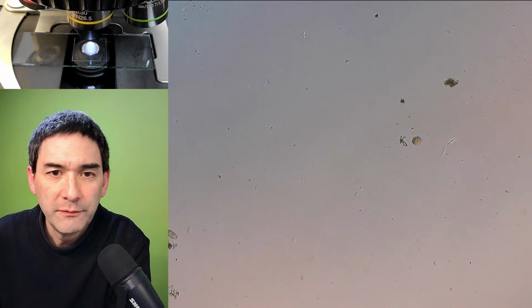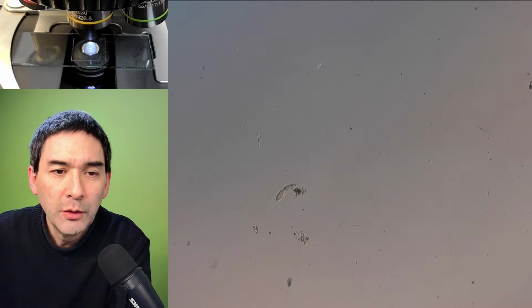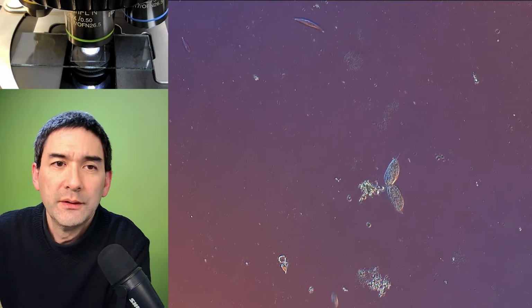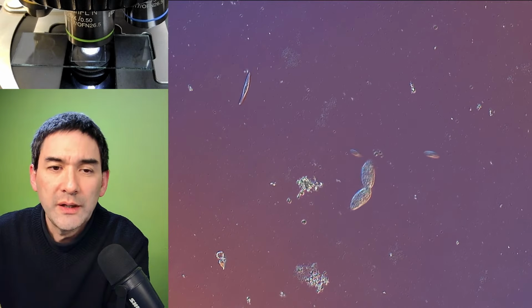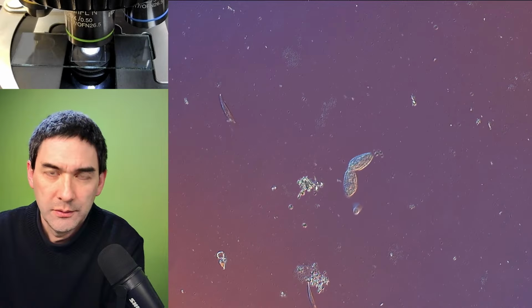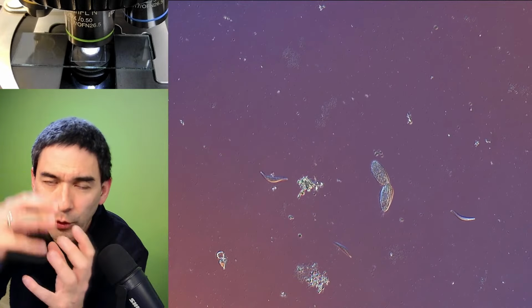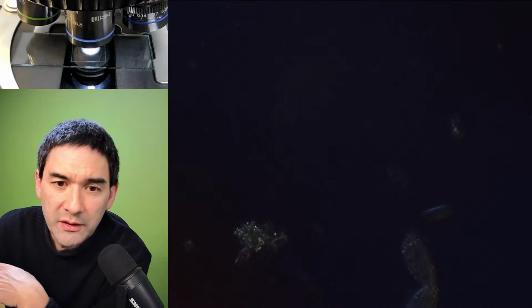Okay, let's have a look if there is more going on here. Oh, this one is dividing. Look at this, isn't this cute? We were lucky, that's a dividing one. And I have to tell you, in a cereal grain, I have seen concentrations that were way, way higher, because in this slime layer that forms, it's just going to be full. But this shows that there's still division going on.